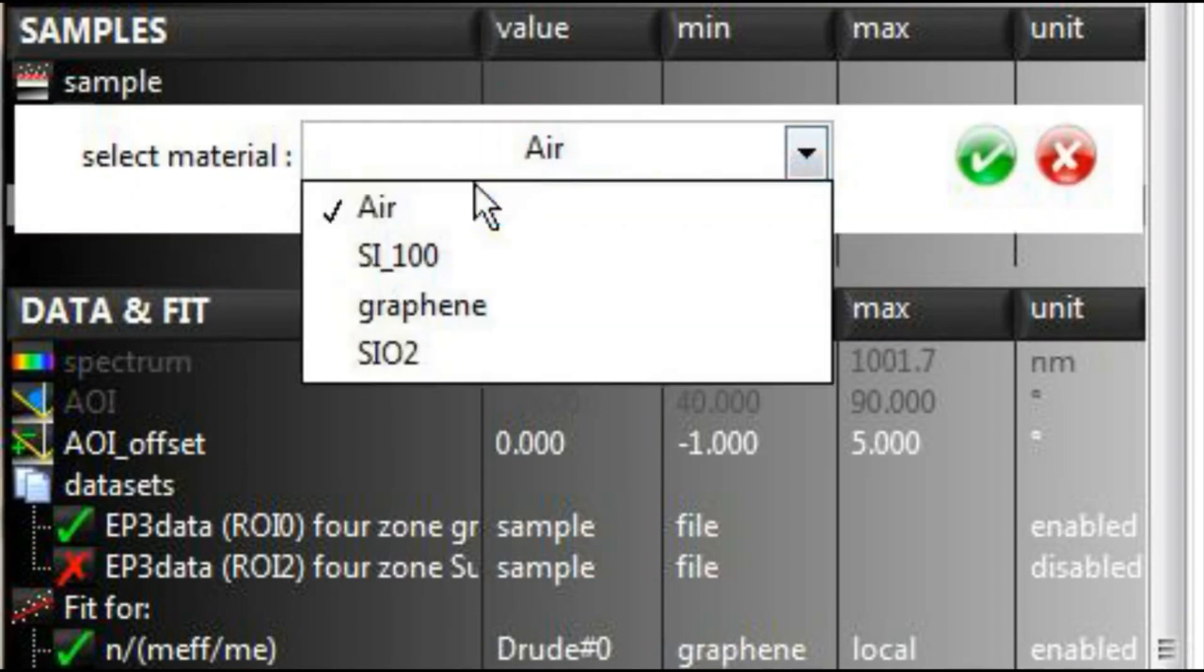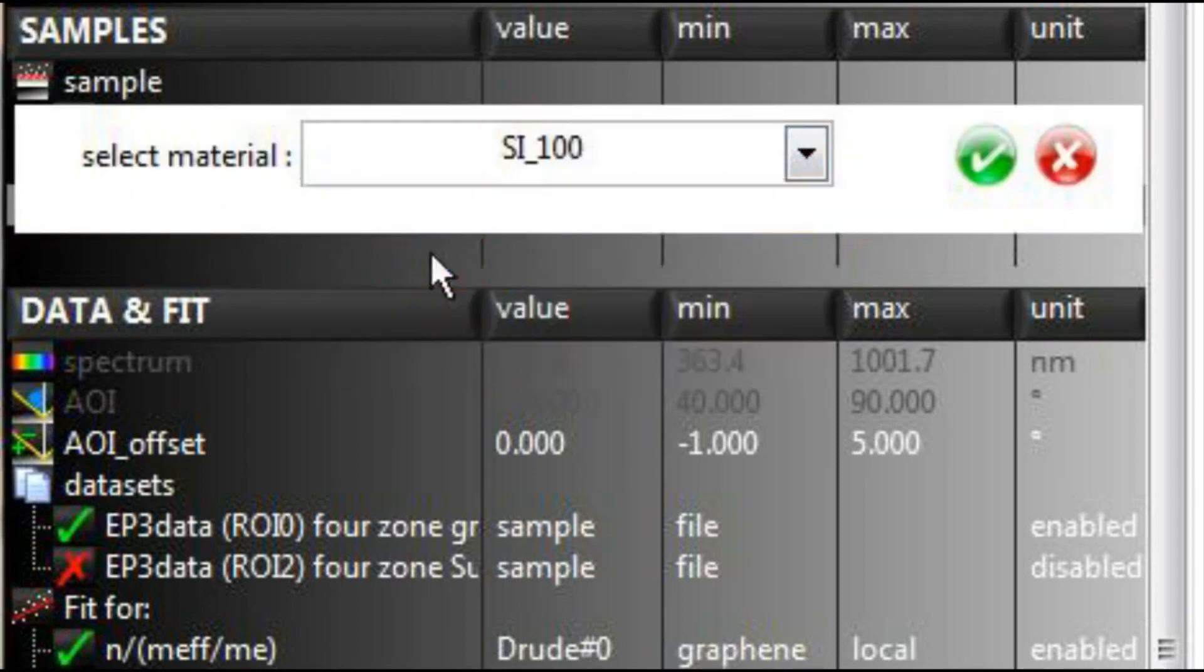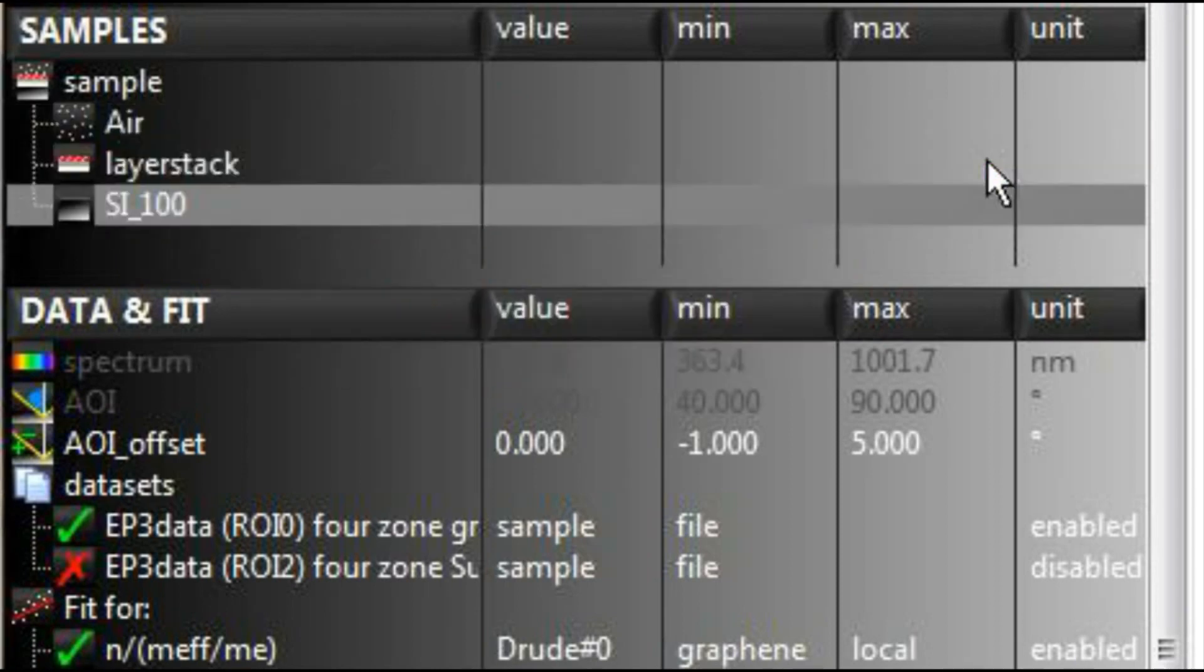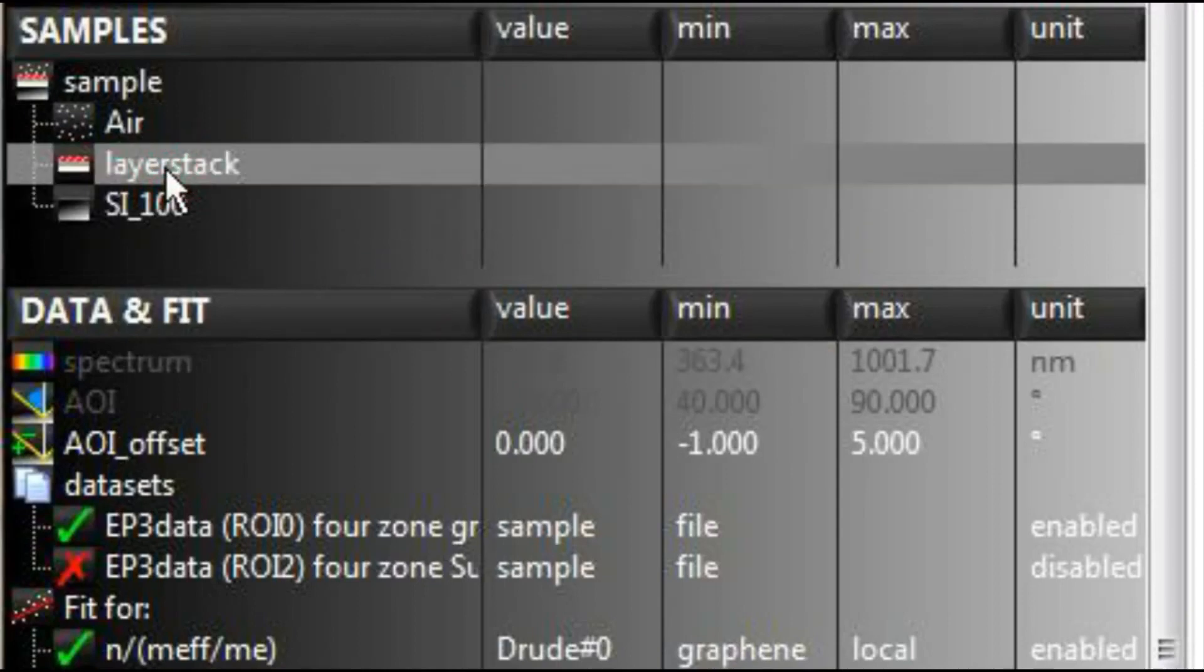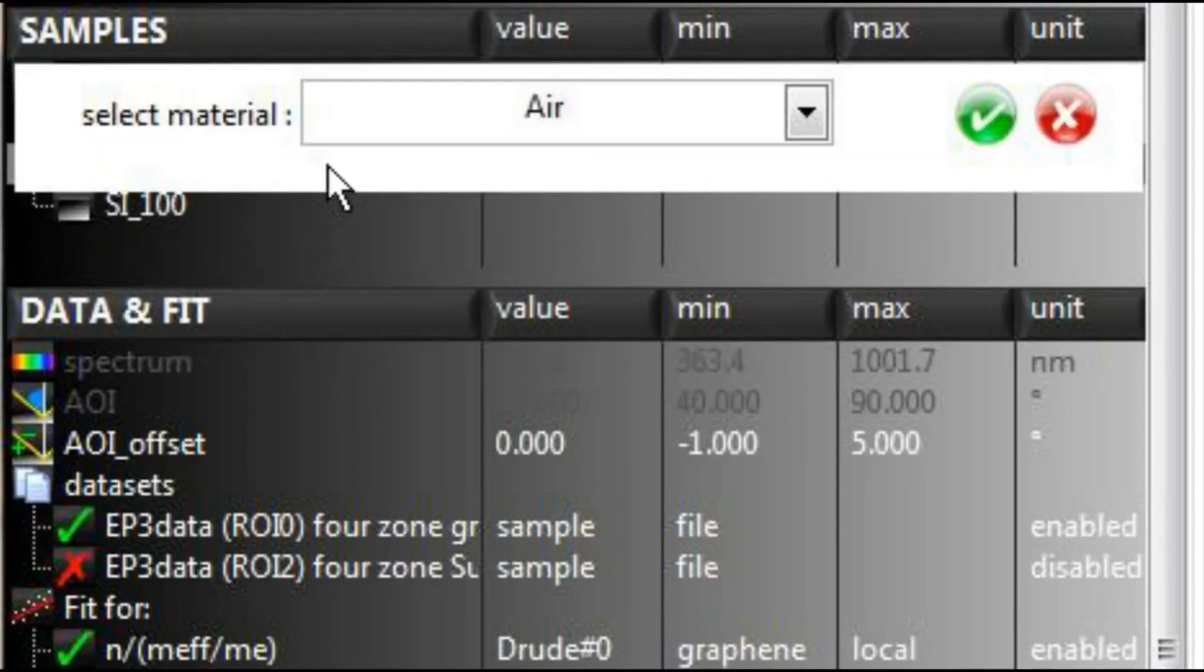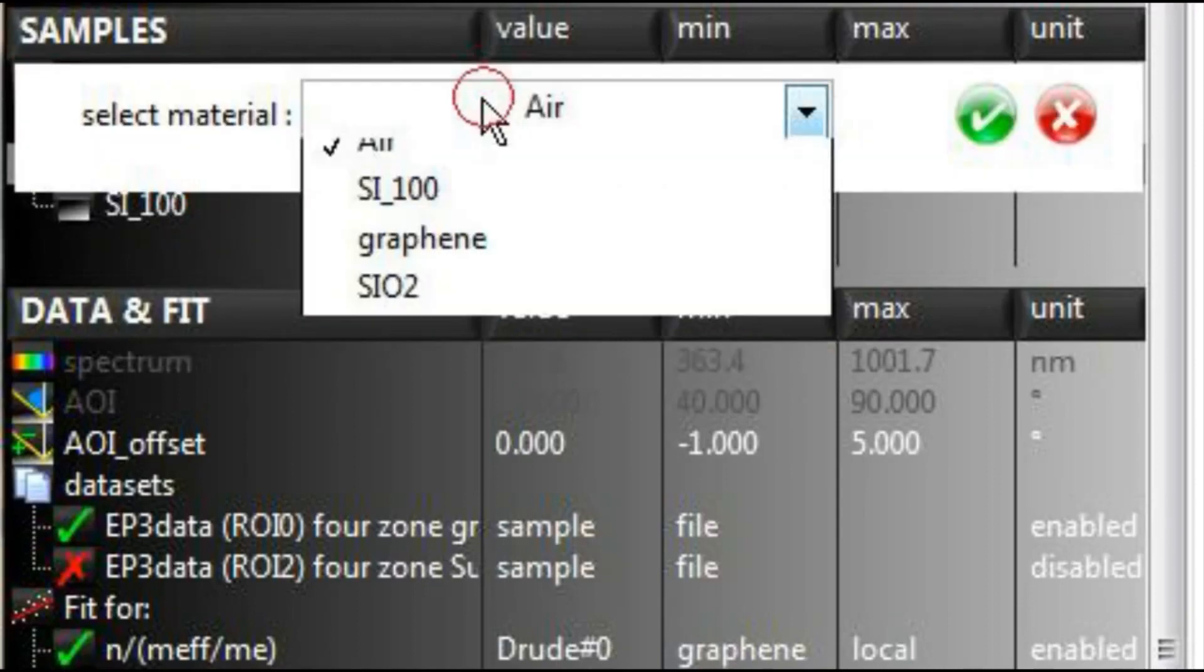In the sample section, you may easily define ambient, substrate, and all layers in between from a selection of materials defined in the materials definition section.